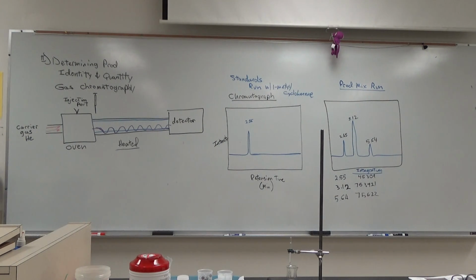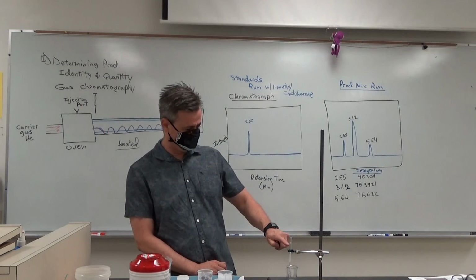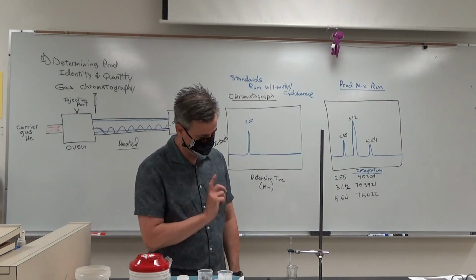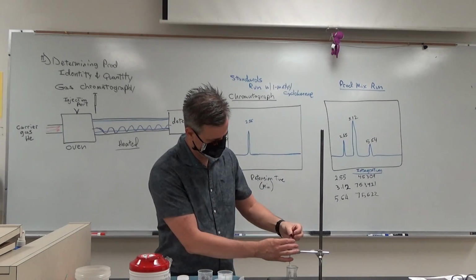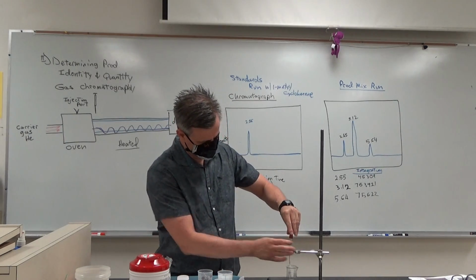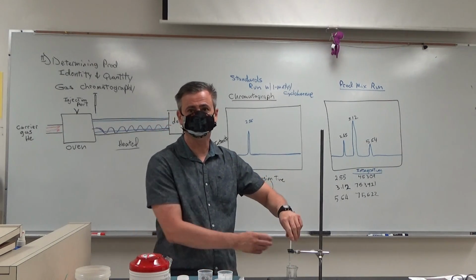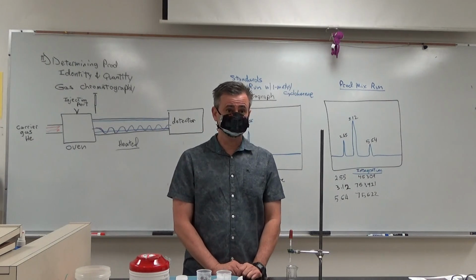Should you wish to opt for the 10-second plan, fill this dude up, okay, with your stuff. Drip, drip. Take one of these guys here, a pipette bulb, put it over there, just give it a push. Boom, done. Okay. Does that make sense, guys?